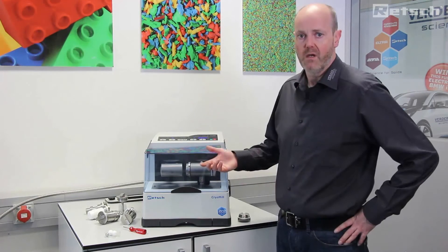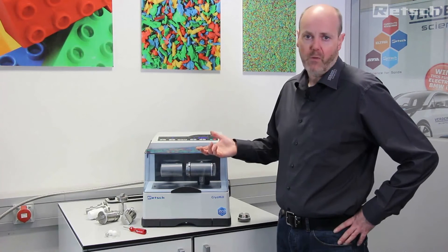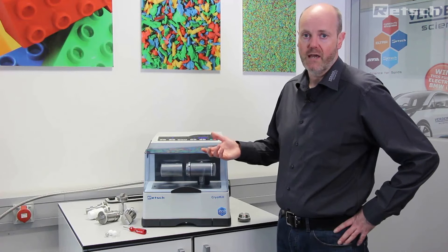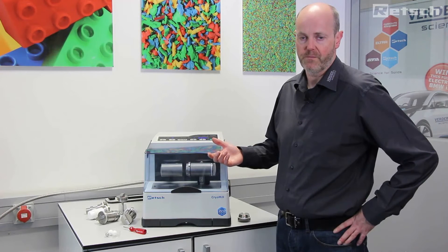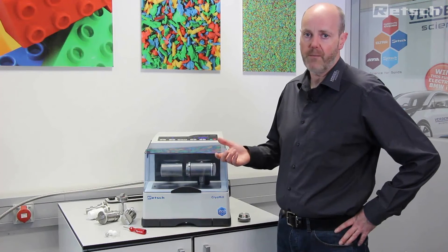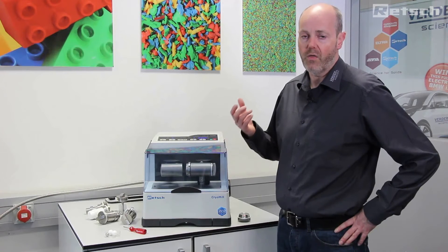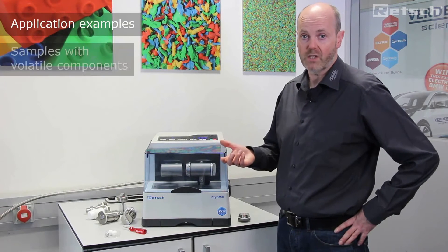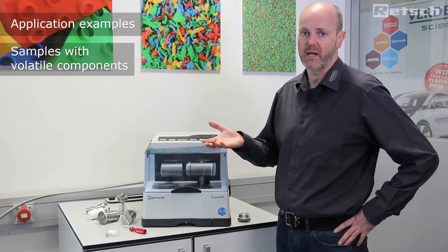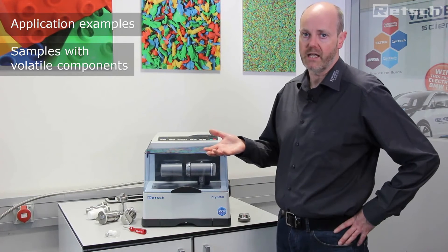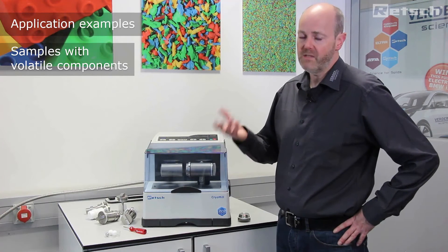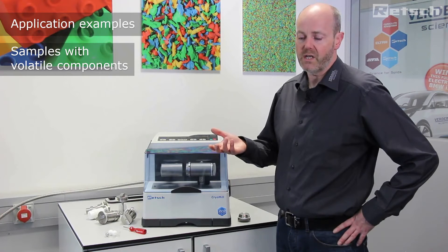Cryogenic preparation is commonly used in various areas of research. Common and typical application areas are those that want to preserve the volatile compounds that may be driven off during ambient preparation techniques, and these may include sample materials such as plant parts, plastics, rubbers, even forensic science.